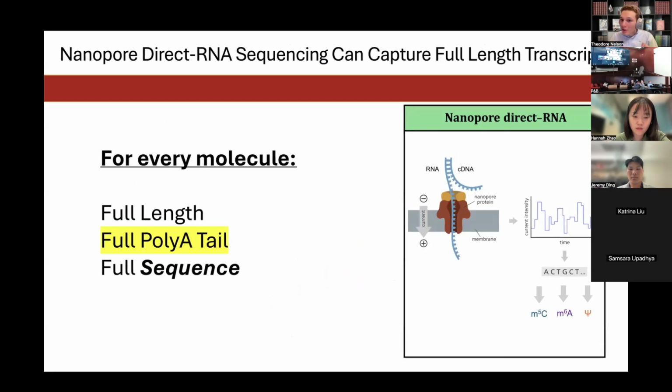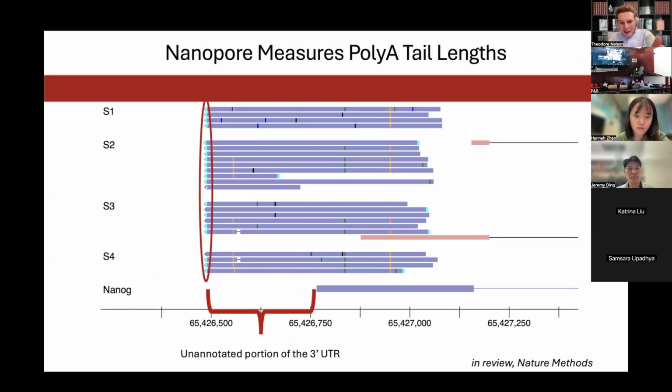Great. So that's how we're doing on full length. Very good at the 3' end with some deficiencies at the 5' end. What about poly A tails? Well, if you look at this graph again, and you look at all of those turquoise blobs that I've circled, those all represent poly A tails because the assay is poly dT primed. You first capture all of the signal from the poly A tail and then incorporate it into the assay.